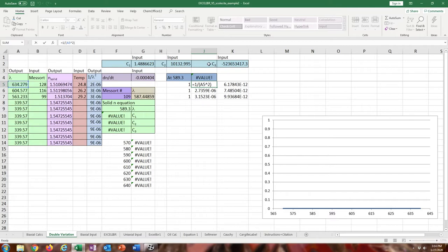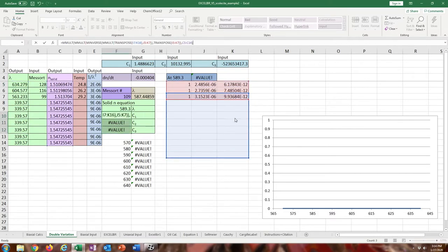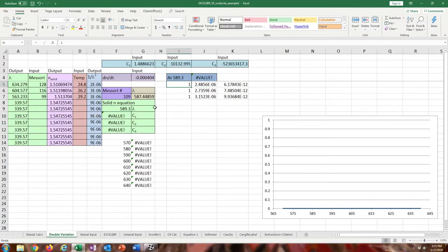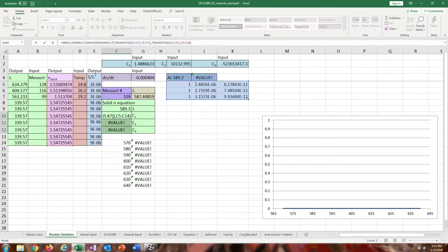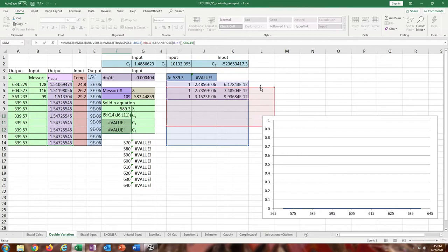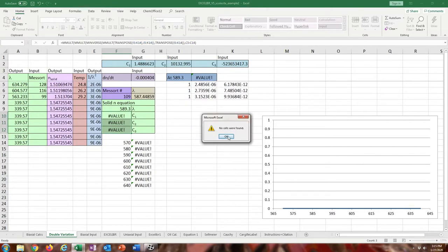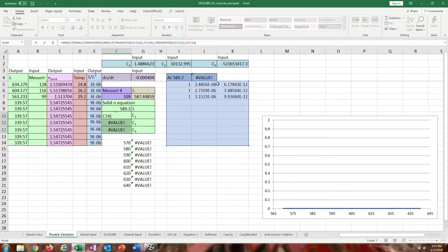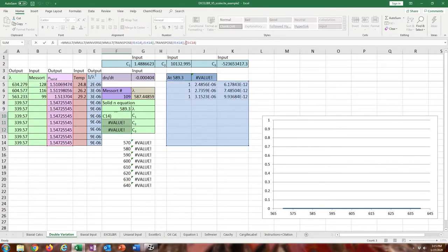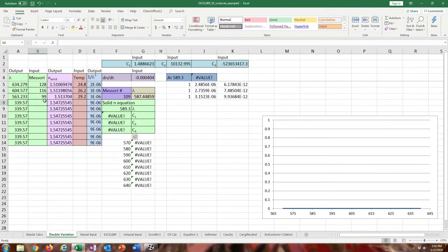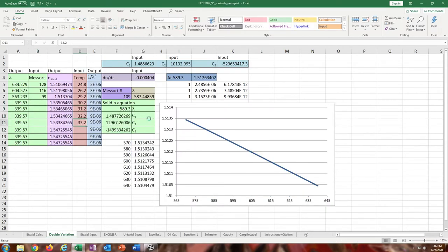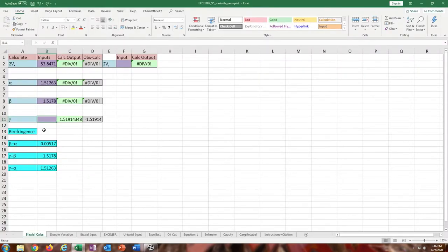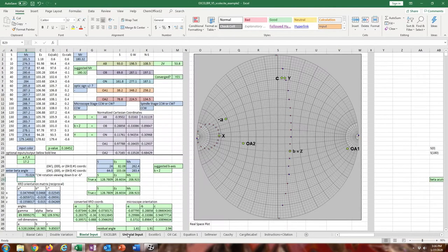If I wanted to include that number of entries, I just drag it down to the same number, drag the formulas down, and make all those entries. Then it will minimize those residuals for the Cauchy constants. I just wanted to figure out what the curve was, the dispersion curve, as you approach 589.3. So I was just interpolating to make good measurements at the standard wavelength for measuring refractive indices.